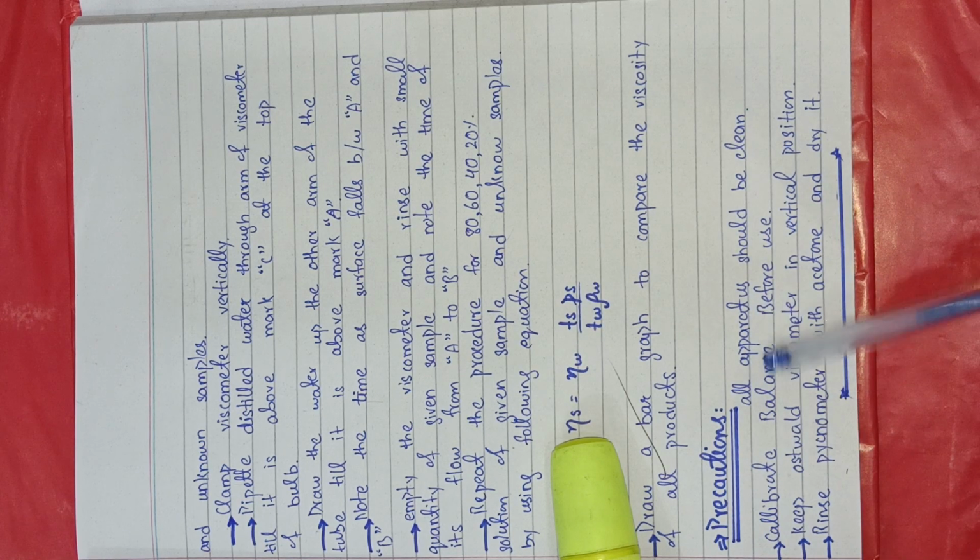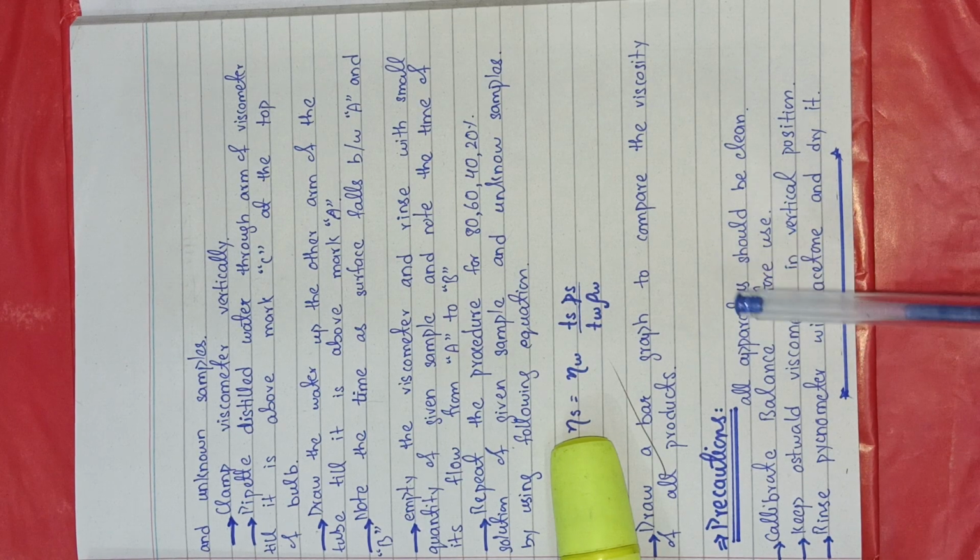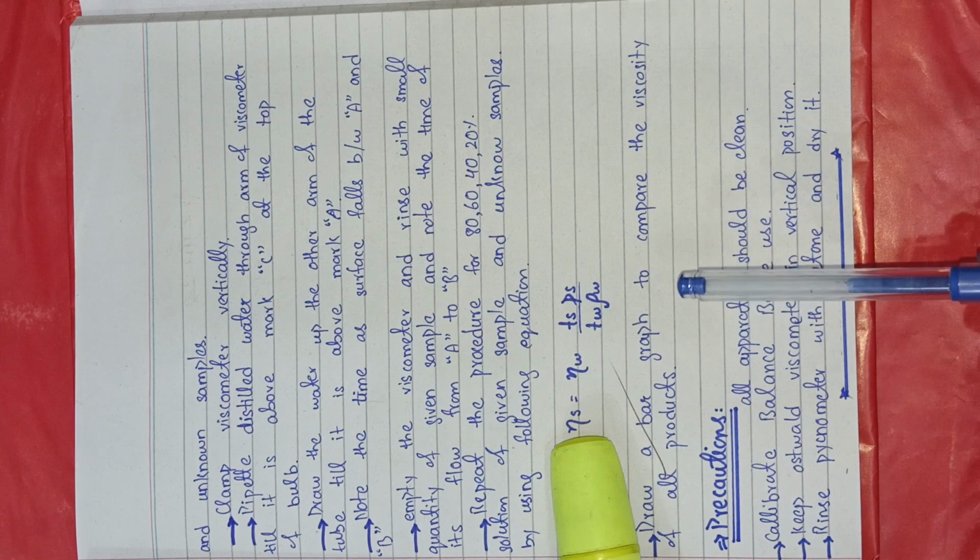You should calibrate the weighing balance before use. Keep the Ostwald viscometer in the vertical position, that is really important. Rinse the pycnometer with acetone and dry it, and you should be careful that no drop of acetone is present in the pycnometer. Now we move on to the calculations and we see what the values of viscosity are of different pharmaceutical products which we are going to choose.